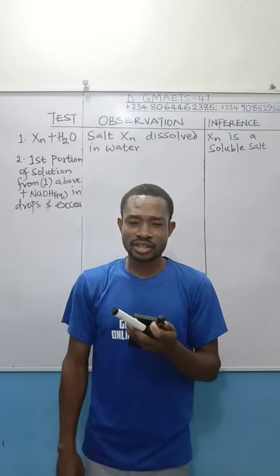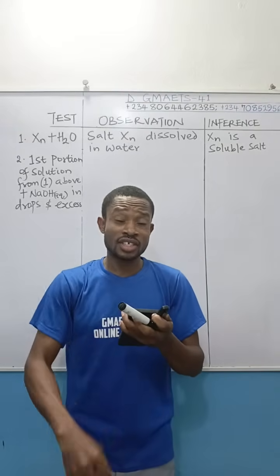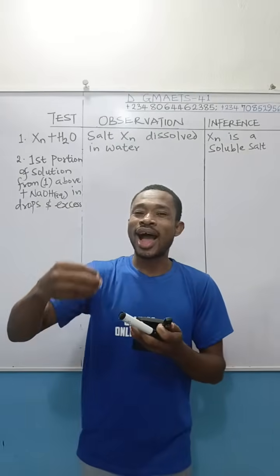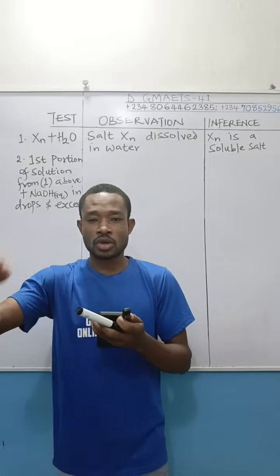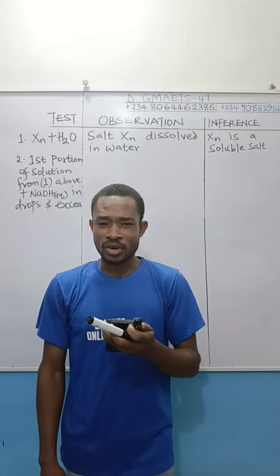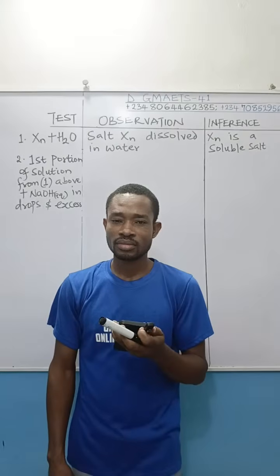Okay, what about lead? Why is it that I did not suspect that it is lead we are likely working on here? If it is lead, dear friends, in this instruction, maybe the second portion, they will tell you to add potassium iodide or potassium tetraoxochromate 6, because that is the guide used to confirm the presence of lead. Are you following, right? So if I had heard of that reagent, I could have been suspecting lead. Do you get that, right?